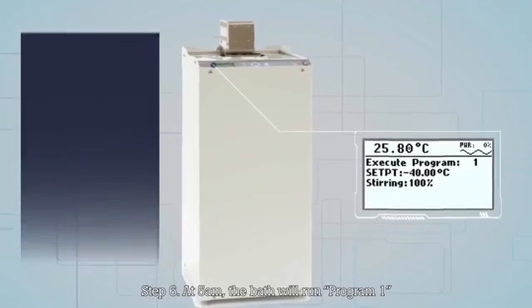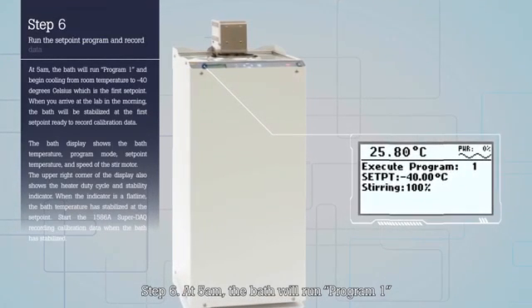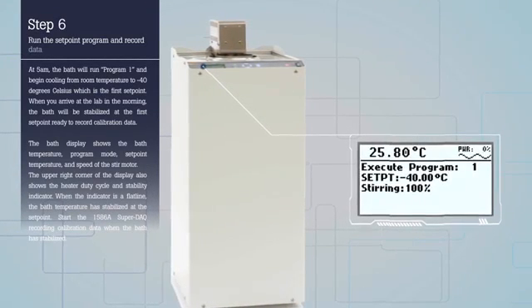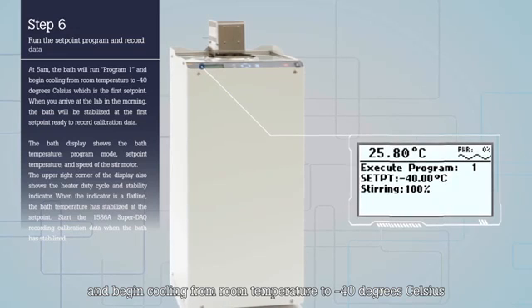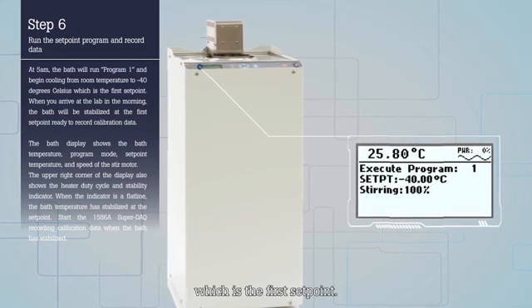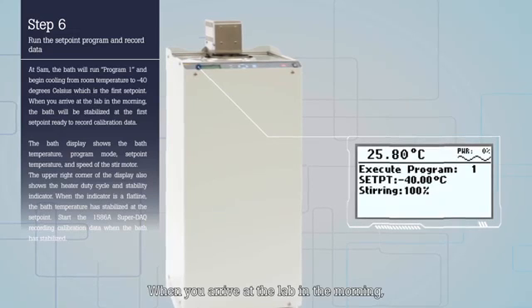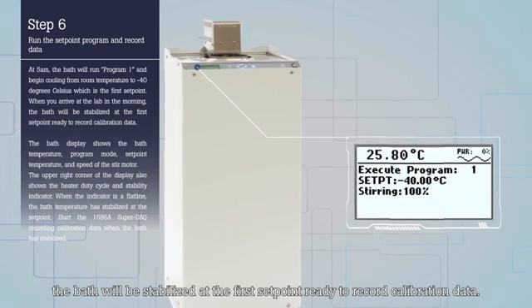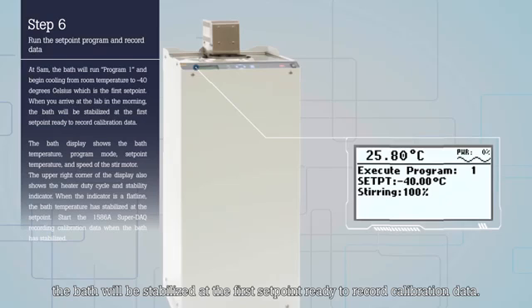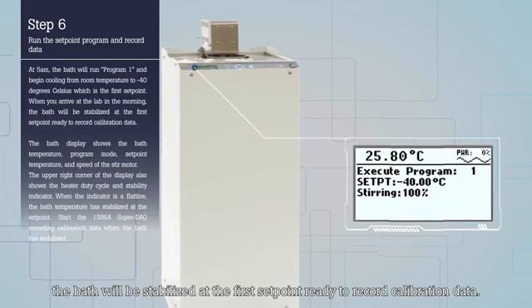Step 6: At 5 a.m. the bath will run Program 1 and begin cooling from room temperature to minus 40 degrees Celsius which is the first set point. When you arrive at the lab in the morning, the bath will be stabilized at the first set point ready to record calibration data.